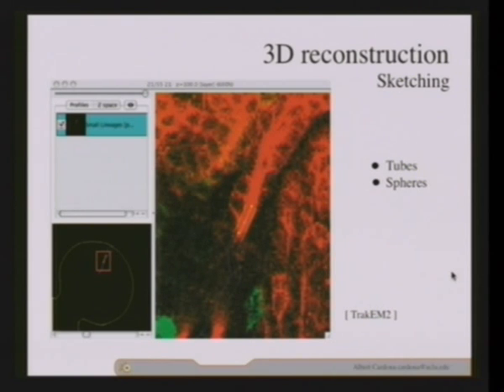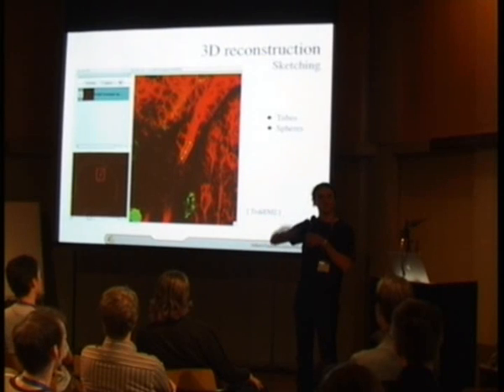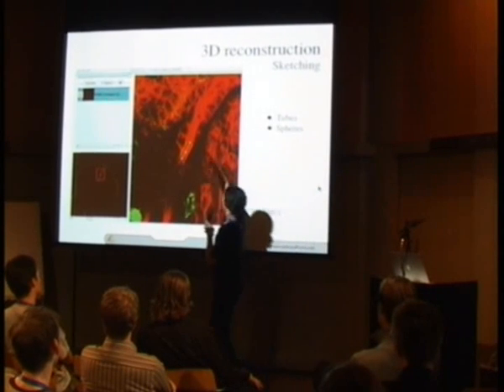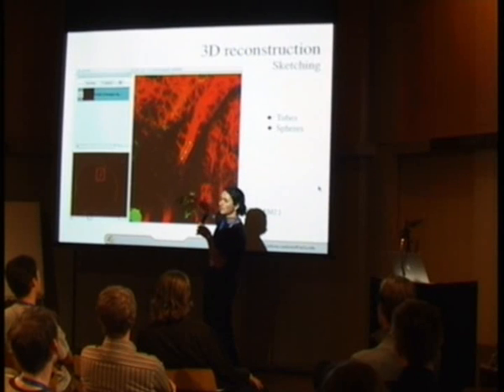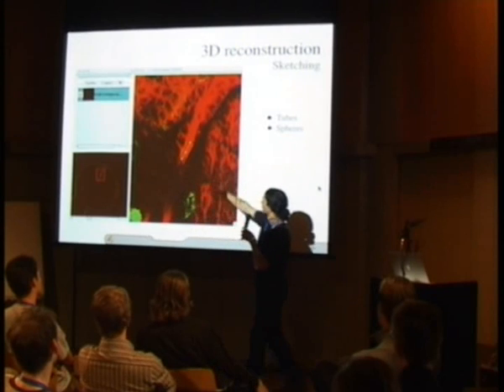Particularly if we have to simulate, for instance, tubes that have to go through my sample, through the sequence of images. So what I cooked up, which also started as a crude hack and I finally kind of like it, is that we can define a Bezier curve that goes over the 3D space of my sample. And at each point of this Bezier curve, I can define a radius. So basically, this is what I have. I can draw in my own GUI in ImageJ just a tube, and this tube will have a radius and two control points for the Bezier curve.